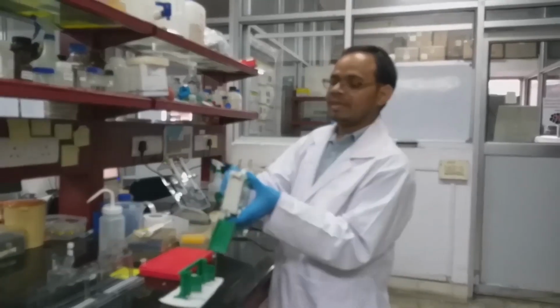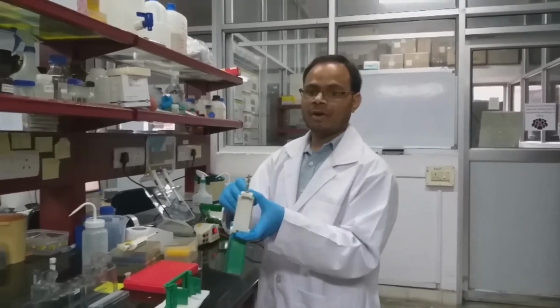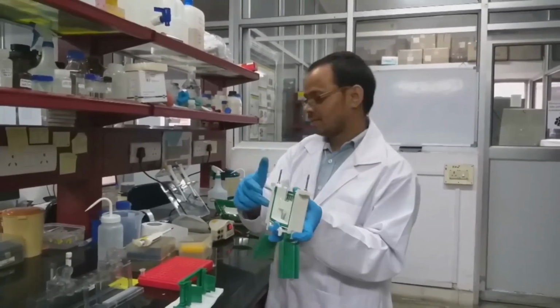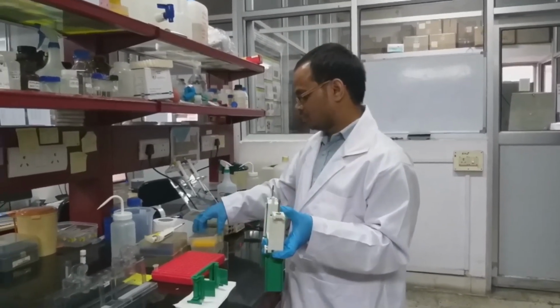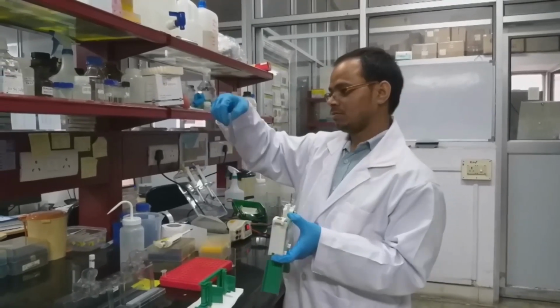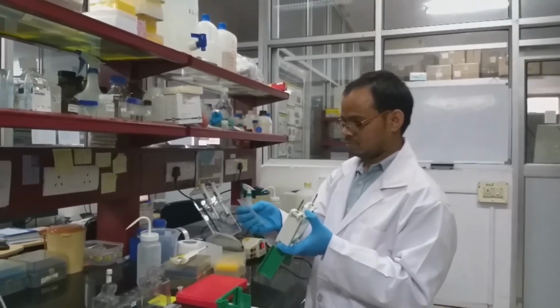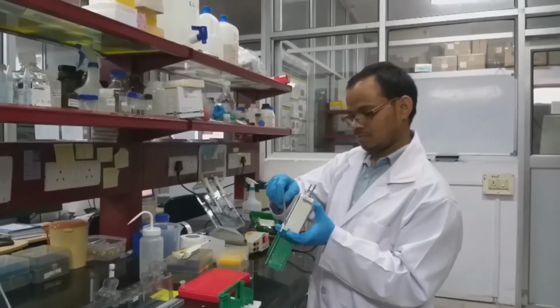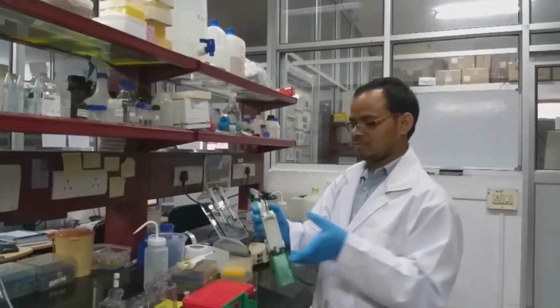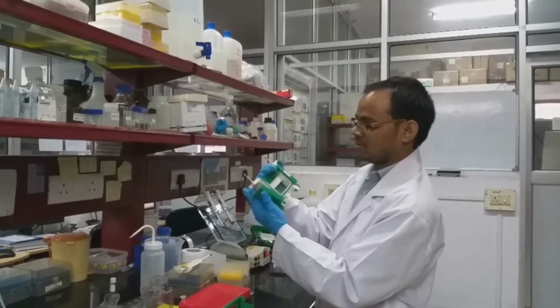So inside this tank, we only have this one side. You have to cover the other side also. For that, we use a dummy plate. You just hold it tight and close this.